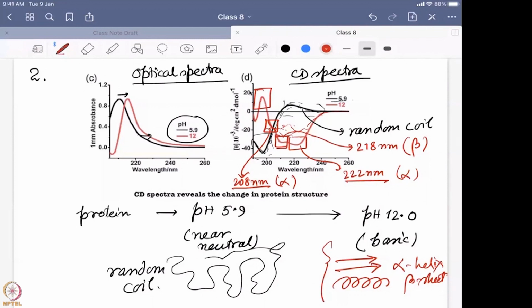There is no particular change going to happen in the amide backbone with respect to the pH in this particular region, 6 to 12. However, the side chain residues might have a huge role to play. And which groups can actually be affected in this region, pH 6 to pH 12? Those groups will be affected which have a proton exchanging group that has a pKa in that region.